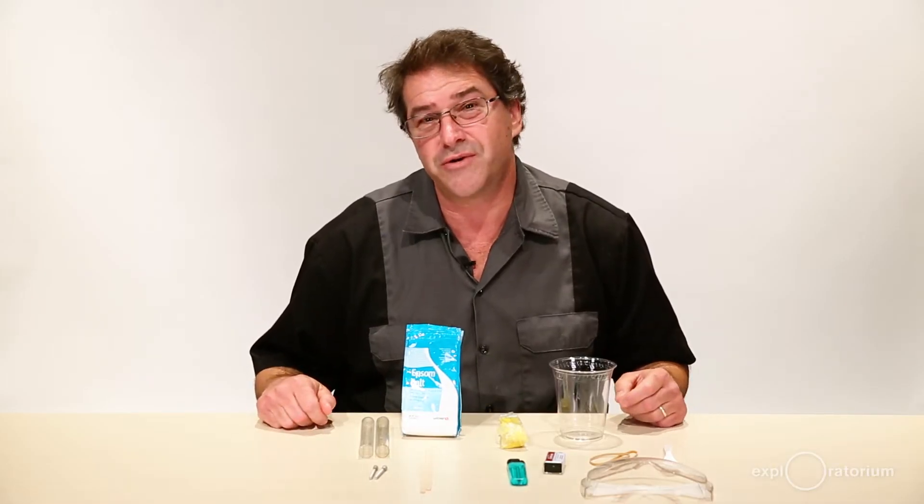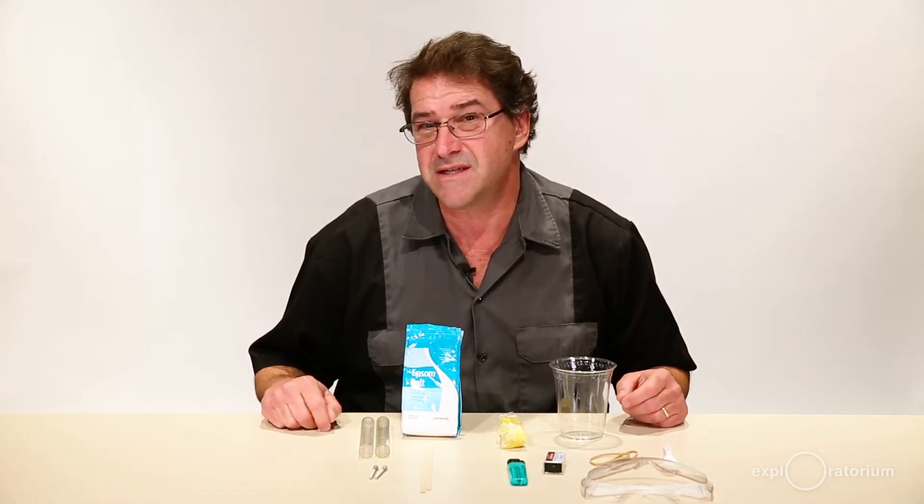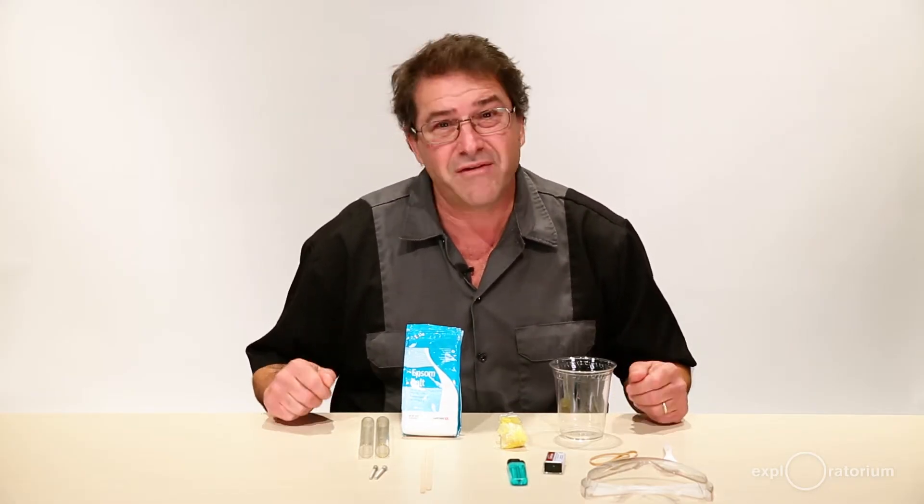My name is Eric Muller of the Exploratorium Teacher Institute, and I'm going to show you how to build your electrolysis device so that you can do the activity 'Having a Gas with Water.'